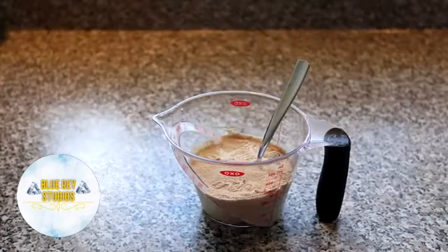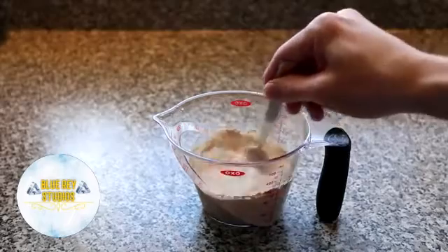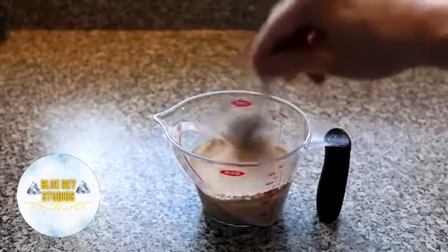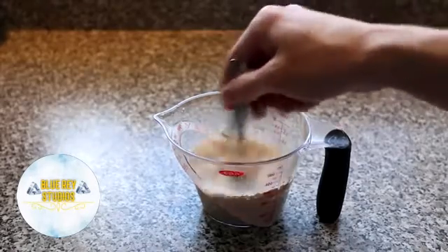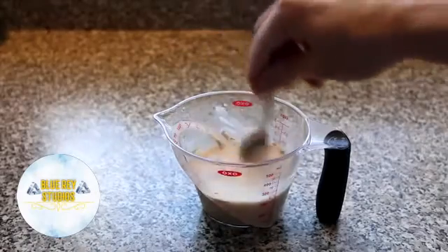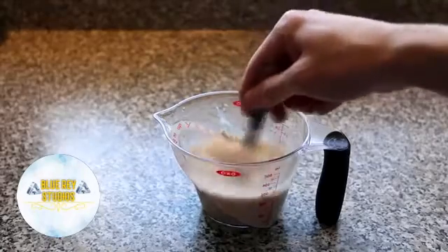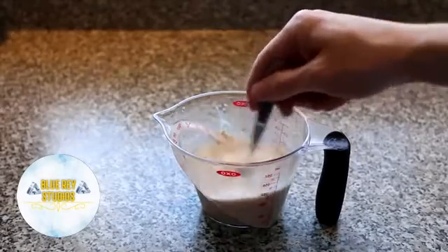After both packets have been added, stir the yeast suspension and allow it to sit for about 15 to 20 minutes. It is extremely important that you don't let the yeast sit here for more than 45 minutes. This is why it's important to cool your sugar solution to room temperature before proceeding to this step, because you can't add yeast to hot water.